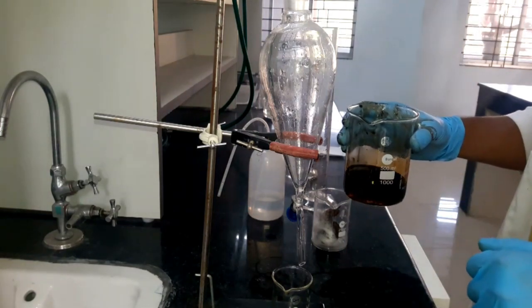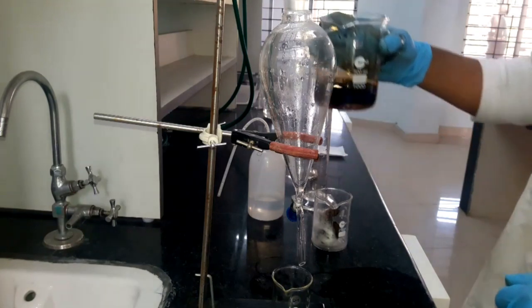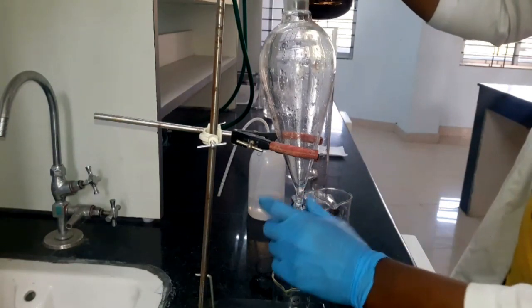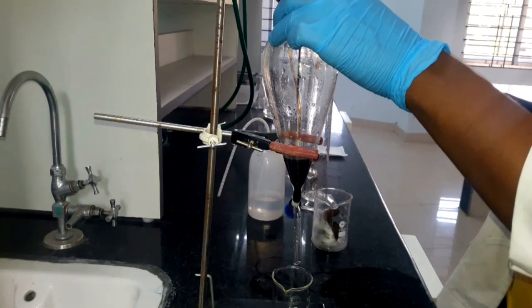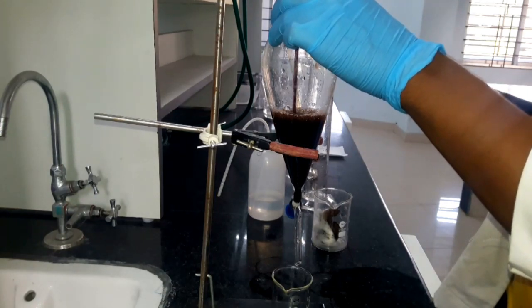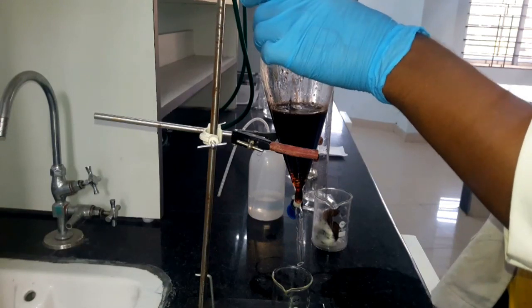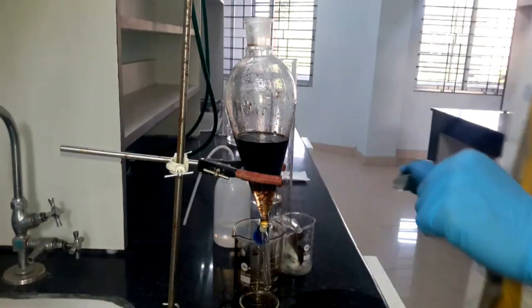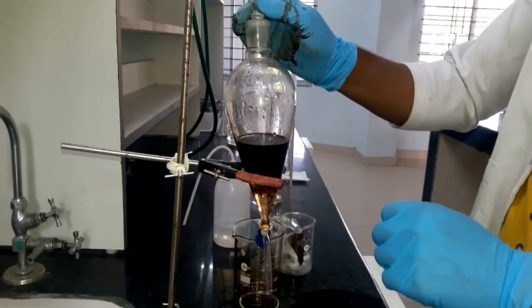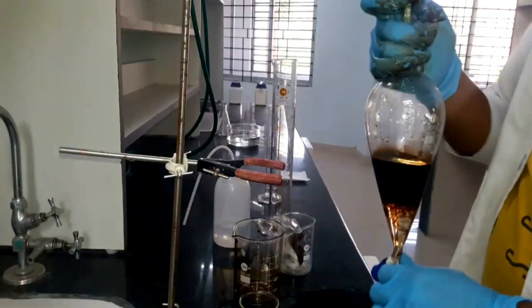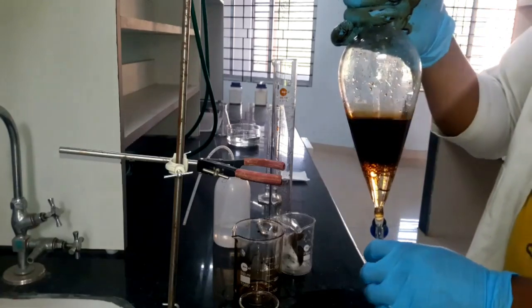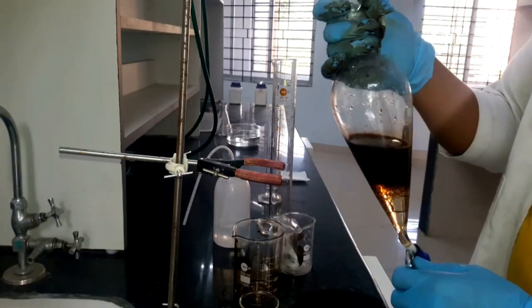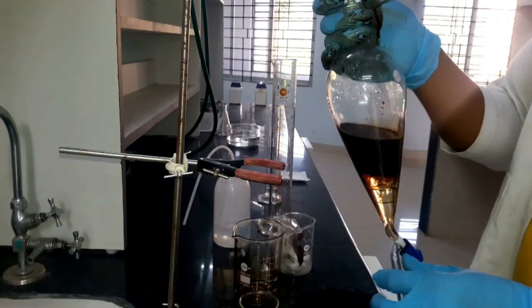The organic layer is extracted by separating it from the top. Now this solution is put in the separating funnel. One important point is that we should avoid vigorous shaking of the separating funnel which may result in emulsion.